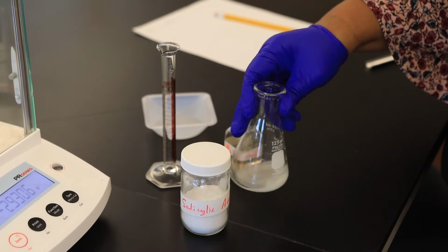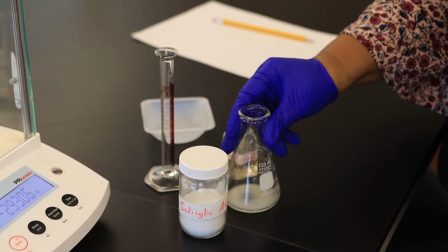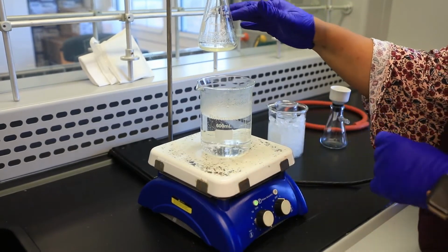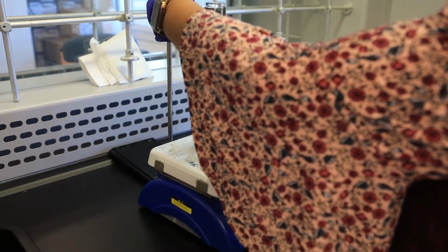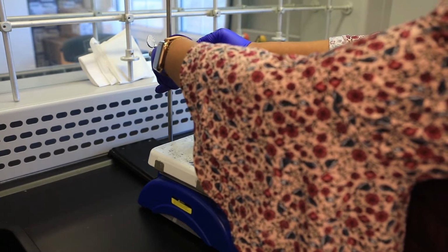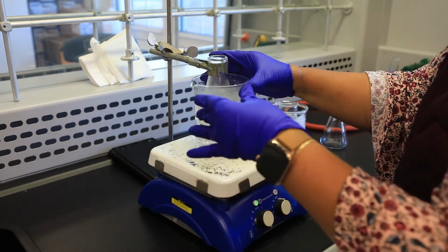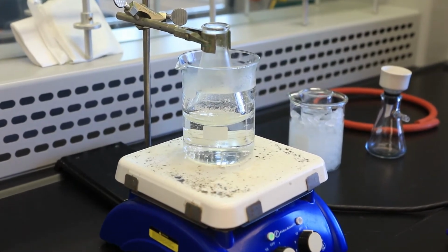So I'm going to transfer this now over to our hot water bath, and then we're going to heat for about 20 minutes. In order for this reaction to go to completion, we will need to place it in a hot water bath for approximately 20 minutes. Right now it's clamped in place. For my heating source, I'm using a hot plate, and I'm slowly immersing our Erlenmeyer flask into a beaker of hot water. I'm going to allow it to sit here for approximately 20 minutes.